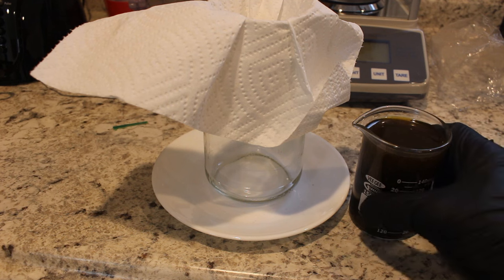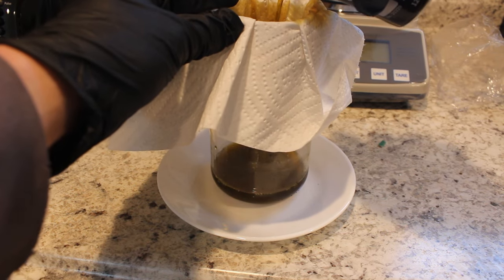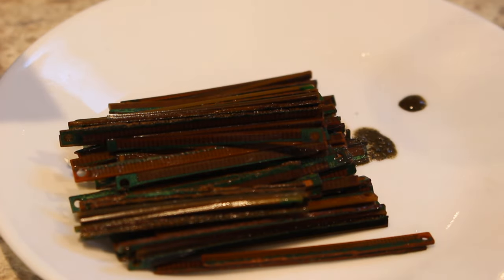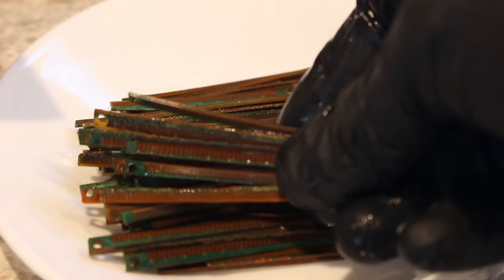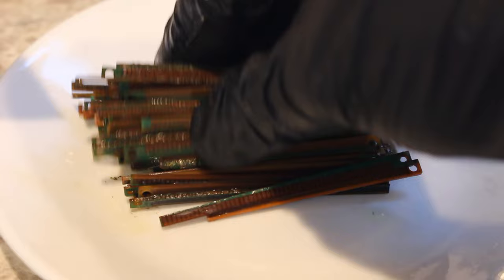This has actually sat for quite a bit longer since the last cut. Notice the solution is still brown, so as long as it's brown I should have the gold still dissolved. Now that I've got these rinsed off, there's not very much iodine on them. Most of the gold's gone — you can actually see the fiberglass underneath where the gold used to be. Very nice, so it's taking it off.